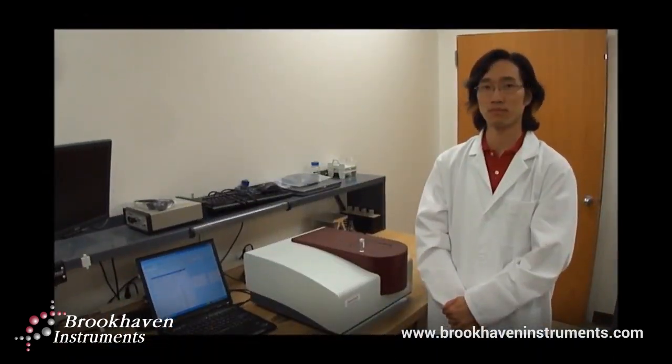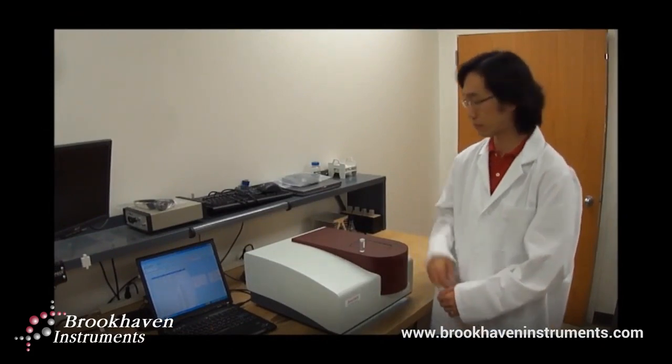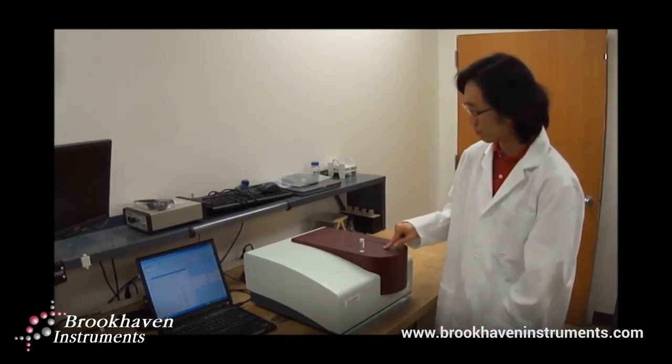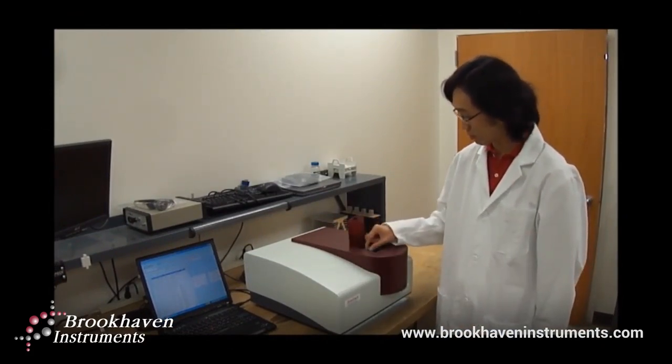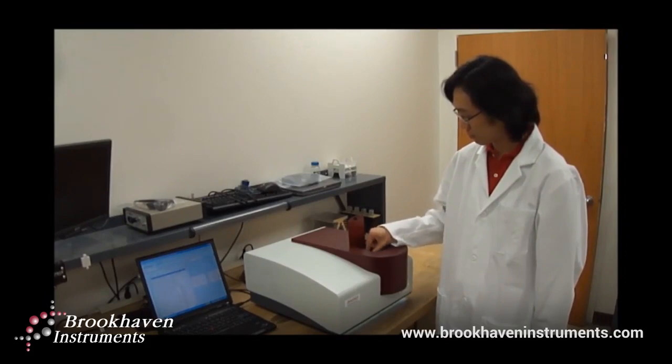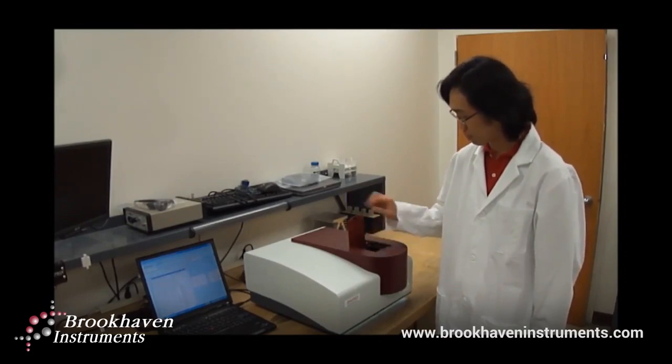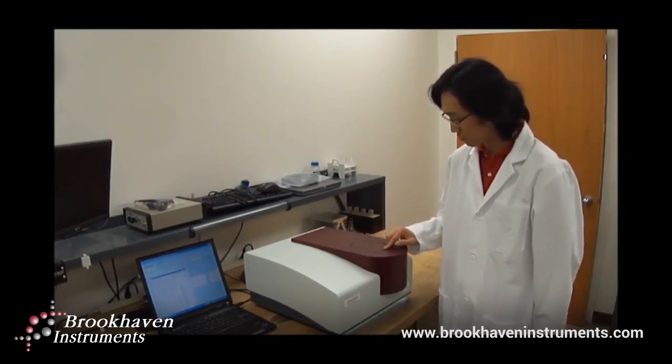I have already prepared a sample for measurement. I will use a Duke 92 nanometer polystyrene latex standard for validation of dynamic light scattering, or DLS.